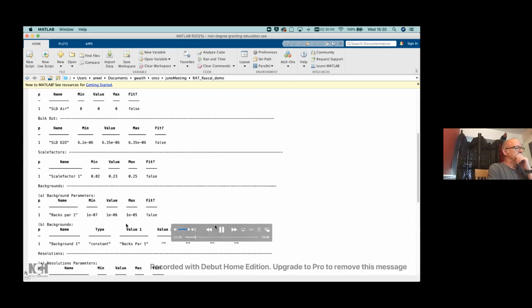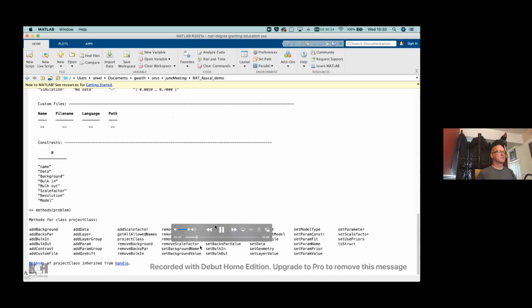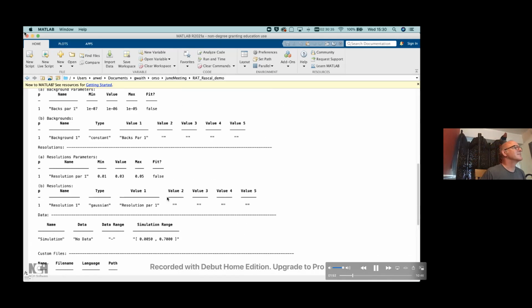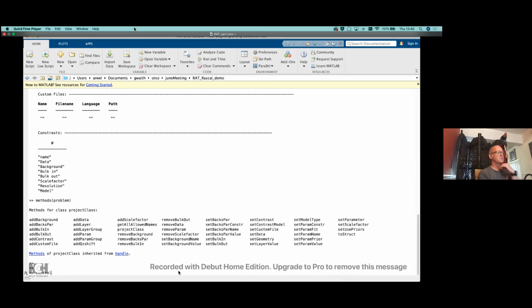And so you can see that to build up the model, what you want to do is populate this class with the various parameters and so on, exactly like we did with the GUI. And we do this by using the class methods, because if we have a look at the class methods, you can see just from the names, you know, add data, remove parameter, etc. By using these methods, you're basically able to build up this class to analyze the model that you want. And we'll have a look at a script for doing this for our problem in a second. And the second one is the controls def class.